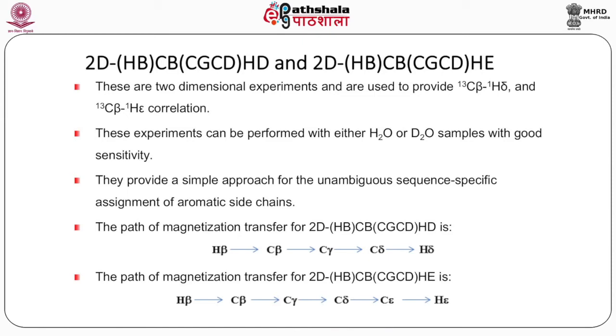Now we have the two-dimensional C13 proton HSQC showing the peaks for the aliphatic region. Many of the very sharp peaks are labeled as HD1, CD1 for I123 and so on and so forth, and basically the sharper peaks come from the methyl groups.